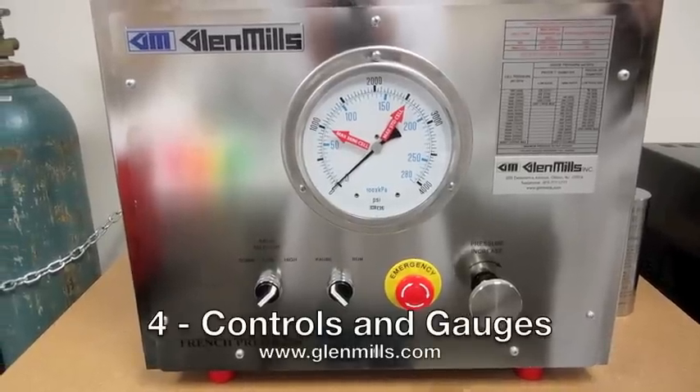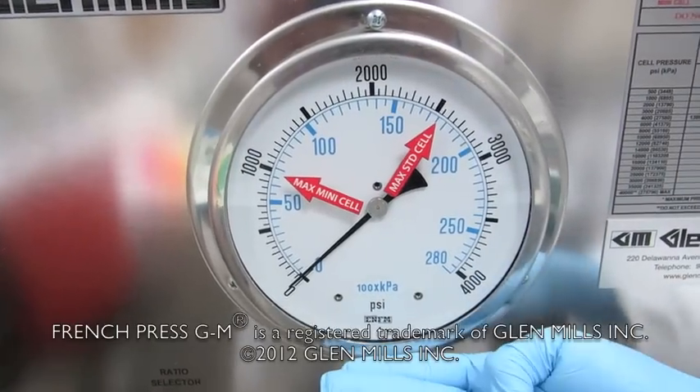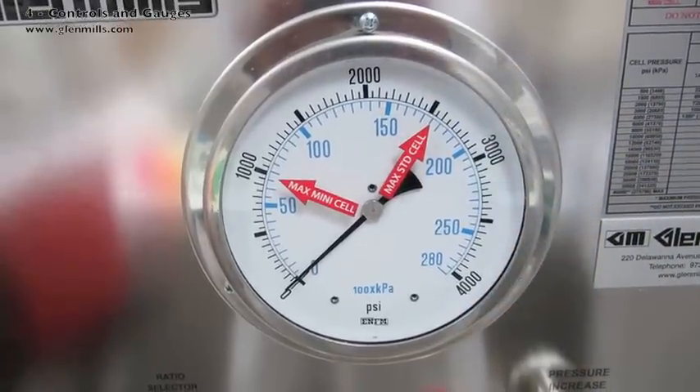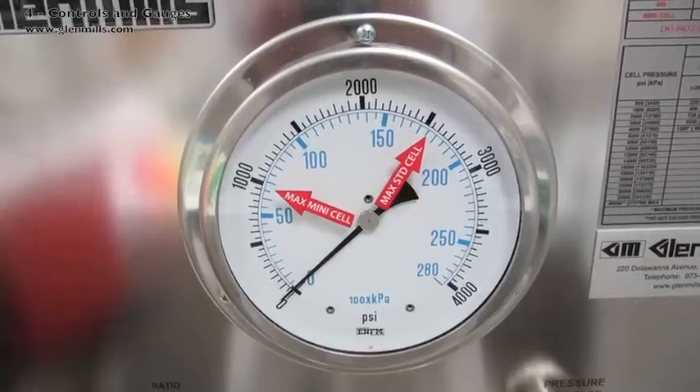On the front are six items. The pressure gauge reads the pressure of the hydraulic press underneath the lower platen. This is not the pressure inside the standard pressure cell. The gauge pressure times 16 equals the pressure inside.